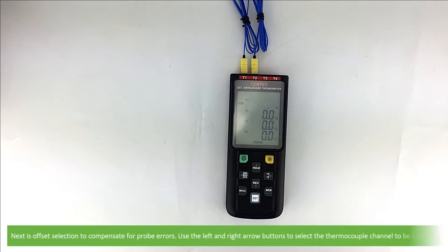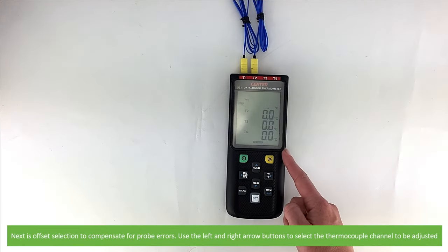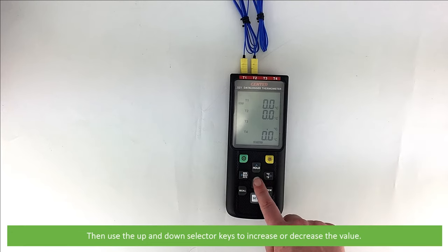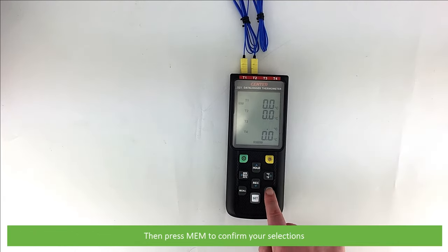Next is the offset selection to compensate for probe errors. Use the left or right arrow buttons to select the thermocouple channel to be adjusted, then use the up and down selector keys to increase or decrease the value. Press memory to confirm your selection.